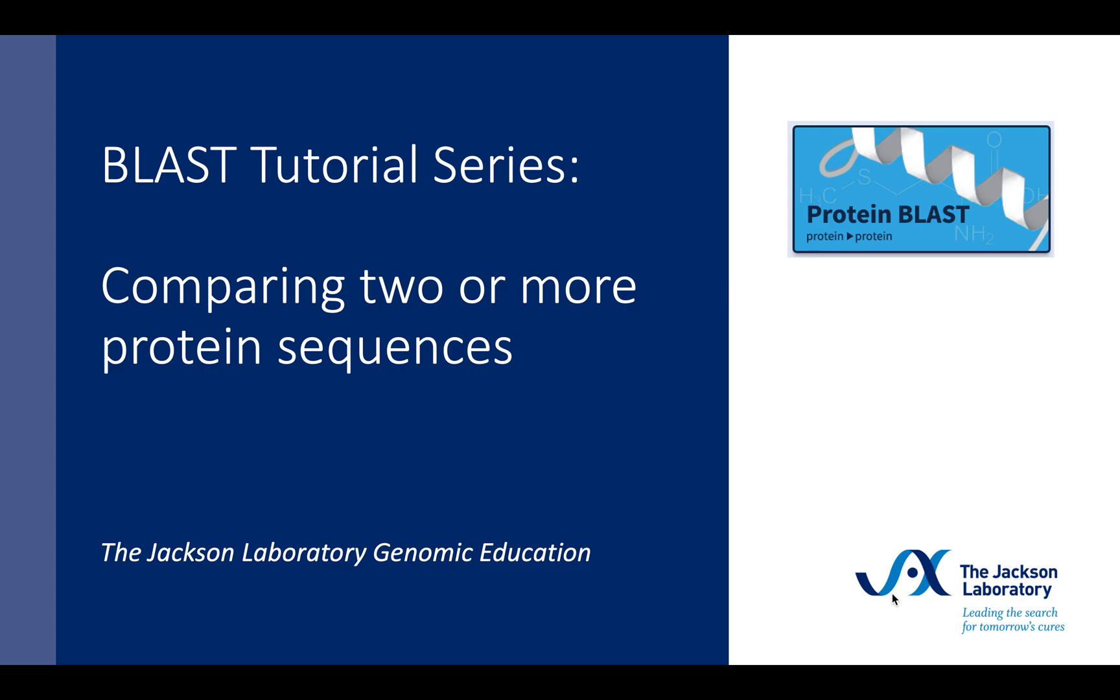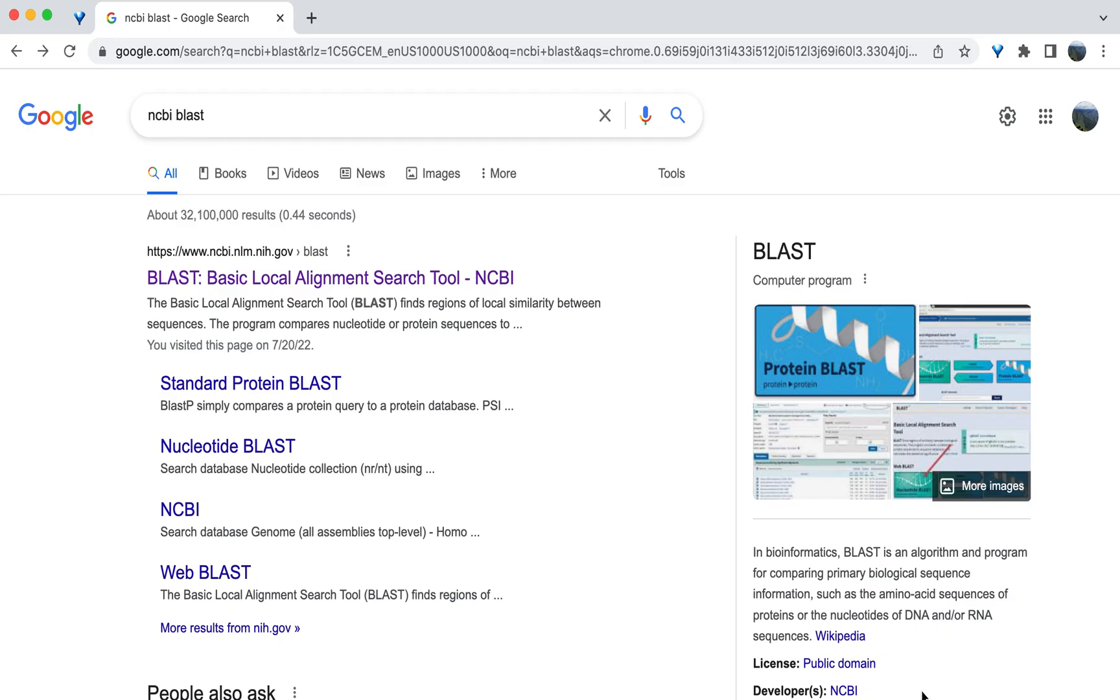Welcome to the BLAST tutorial series brought to you by the Genomic Education Team at the Jackson Laboratory. This tutorial is a demonstration on how to compare or align two or more amino acid sequences using protein BLAST. BLAST is a powerful tool that allows you to compare and identify variation between two or more protein sequences. BLAST will use sequence alignment to accomplish this.